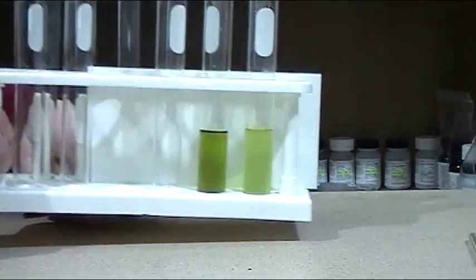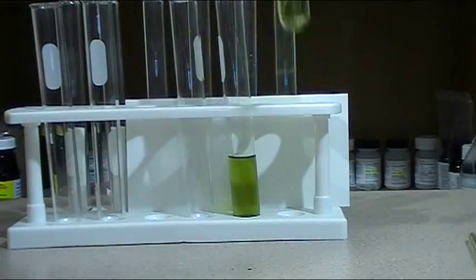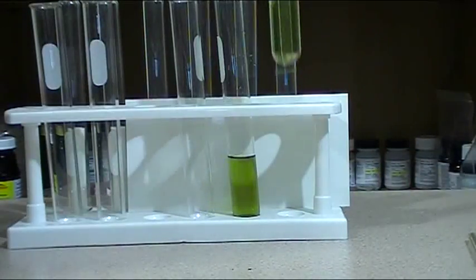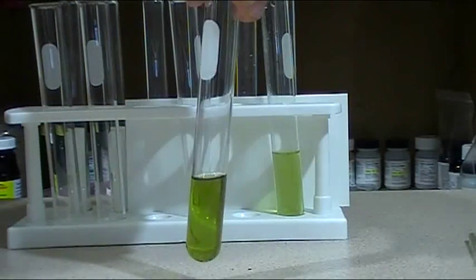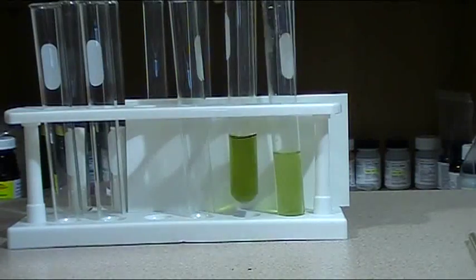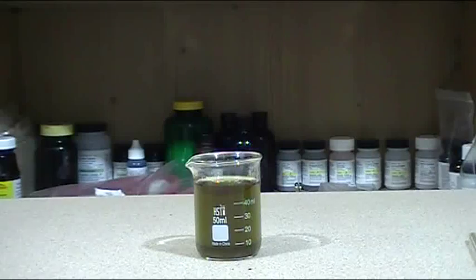Okay, here are the test results. This is after 30 minutes, and this is after one hour. In the end you should have a dark green color.